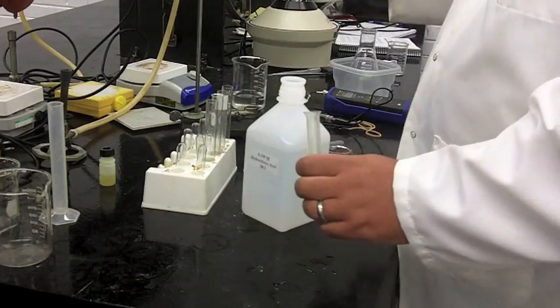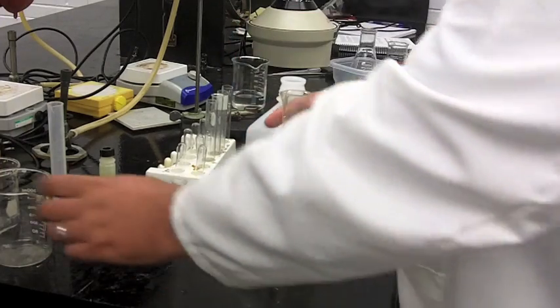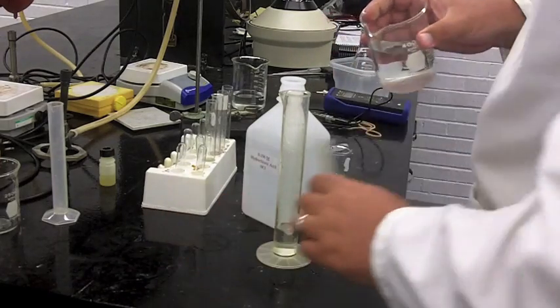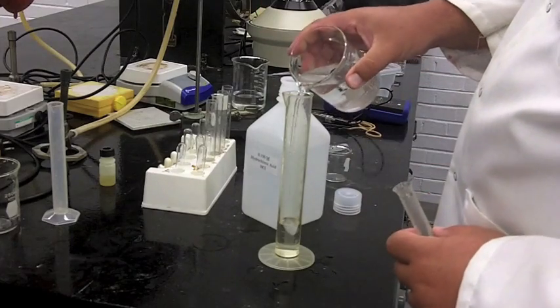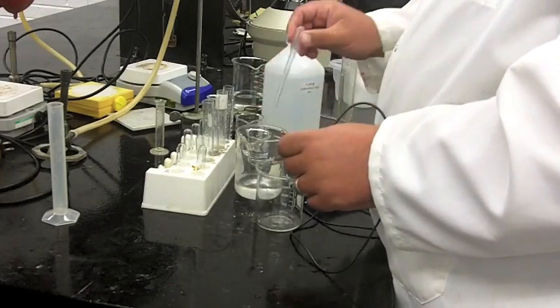Make sure they are properly diluted and you're not leaving drips and everything. And then you'll do the dilutions in larger graduated cylinders. And we'll do that with DI water, and the easiest way to do it is to use a beaker and a dropper probably to get something accurate. And it doesn't have to be exactly the right number. The key, though, and here I'm rinsing out the graduated cylinder too, is that you know the volume so you can calculate the concentrations.